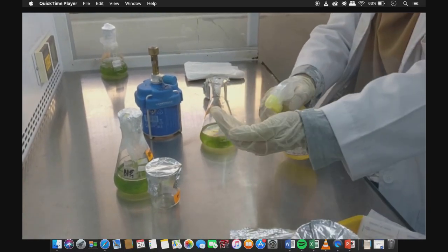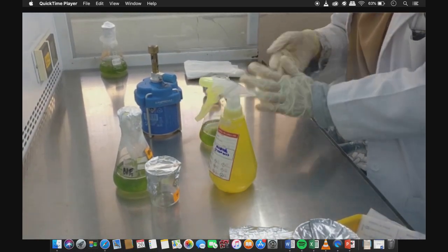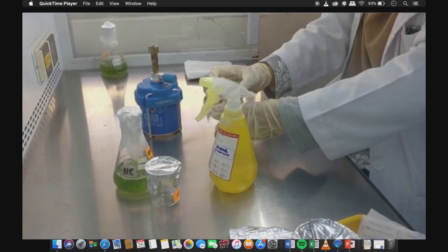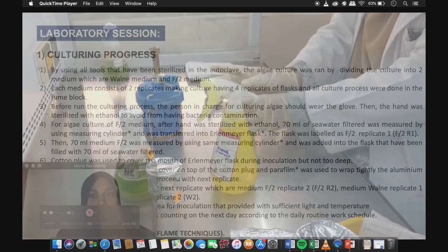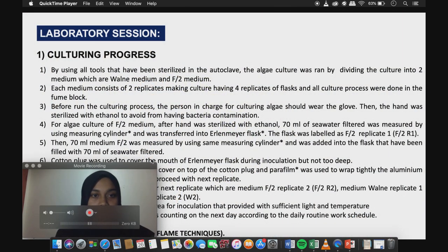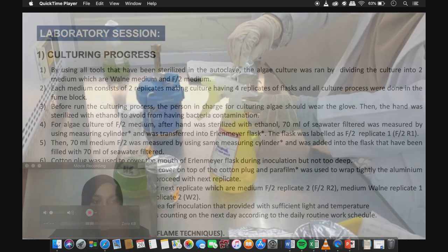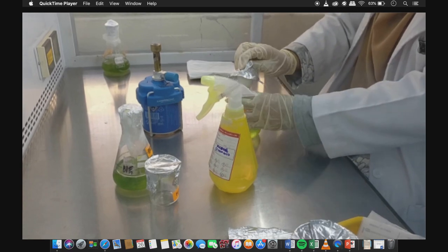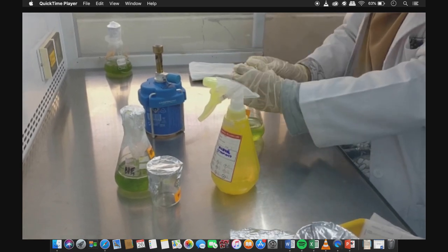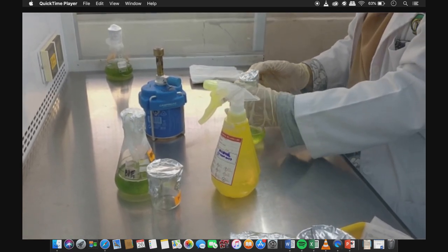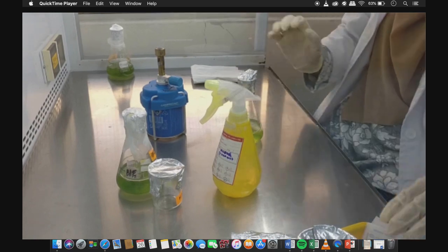Using all tools sterilized in the autoclave, the algae culture was run by dividing the culture into 2 media, W1 medium and F2 medium. Each medium consists of 2 replicates, making 4 replicate flasks in total, and all culture processes were done in the flow cabinet. Before running the culturing process, the person in charge should wear gloves, and the hands were sterilized with ethanol to avoid bacterial contamination.